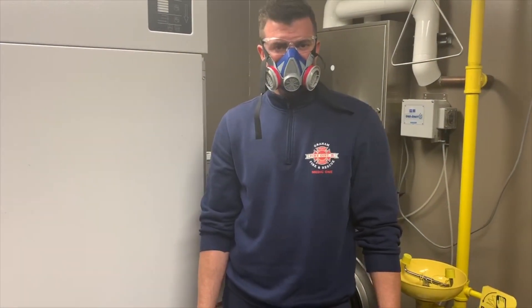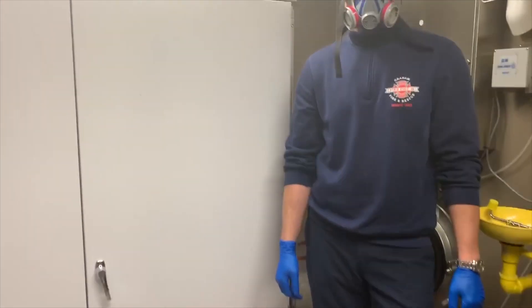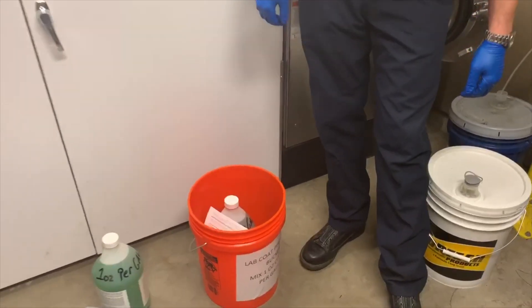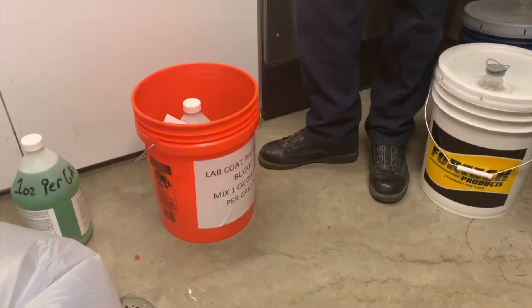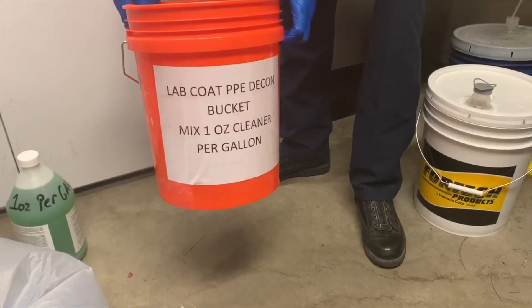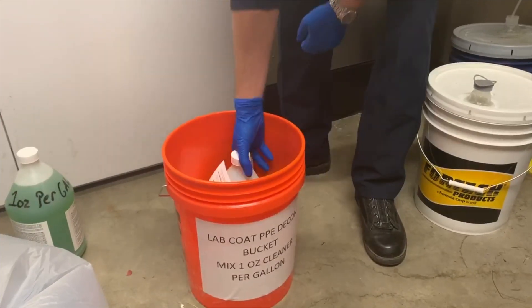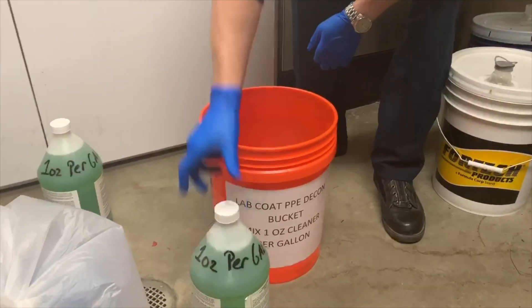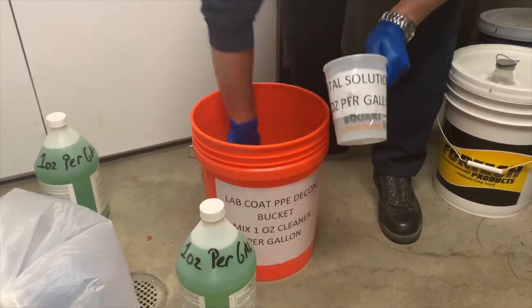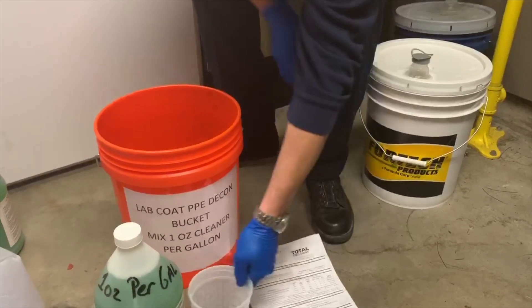Once we get back to the station with our isolation gown in the bag, inside your decon room you're going to find a bucket that is labeled 'lab coat mixture.' It's clearly labeled PPE decon bucket — makes one ounce of cleaner per gallon. Inside the bucket you'll also find the solution, which is Total Solutions, also labeled one ounce per gallon, an MSDS, and a little mixer that is clearly marked with the four ounces.